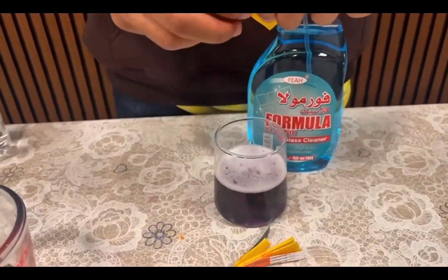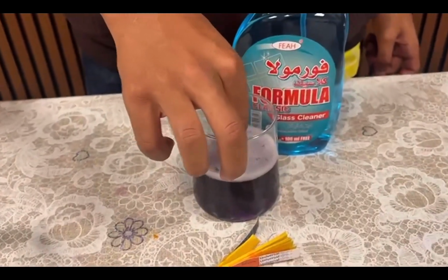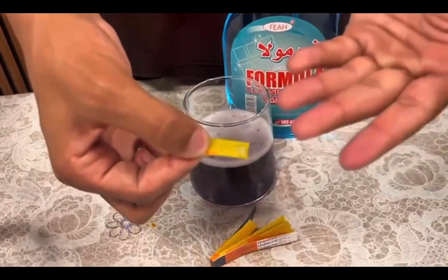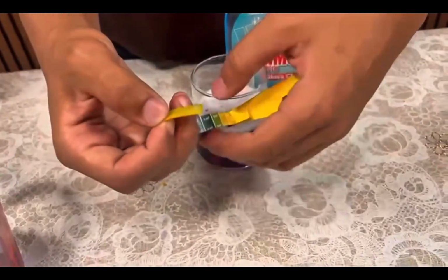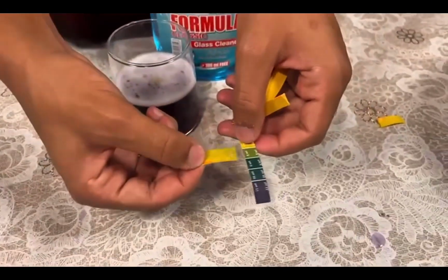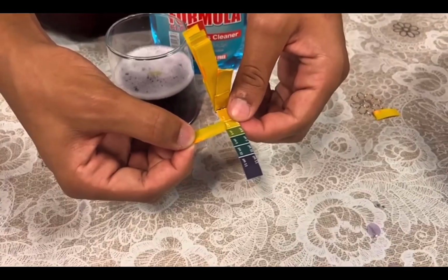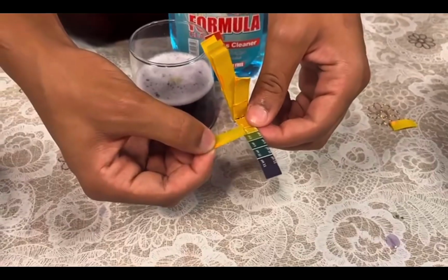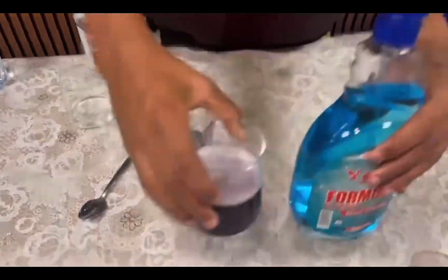Let's make sure. Get our strip, dip it, and making sure. Let's see. Flick. Yep. It is closer to a faint green color. Okay. Yeah. It's definitely not neutral or acidic. It's up there with the bases. Yeah, just around there, 7 to 8. It's most likely in the middle. As expected. Okay. Move that to the side. Get that out of the way.